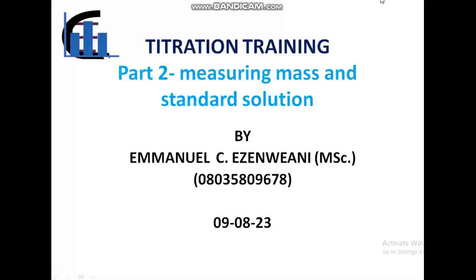I welcome everyone to this part 2 of the titration training. This lesson video covers measuring mass and standard solution.